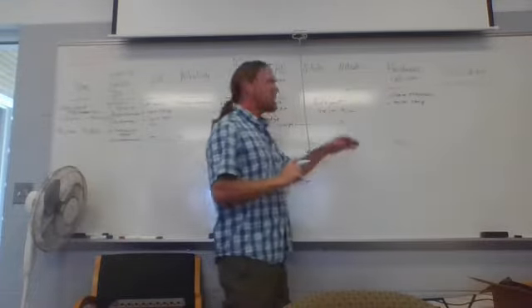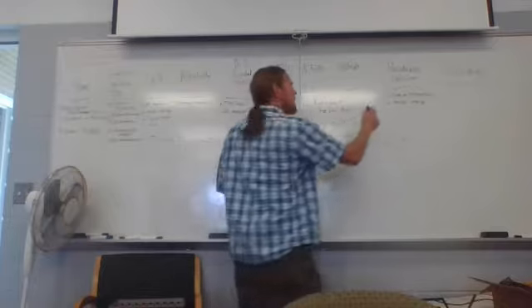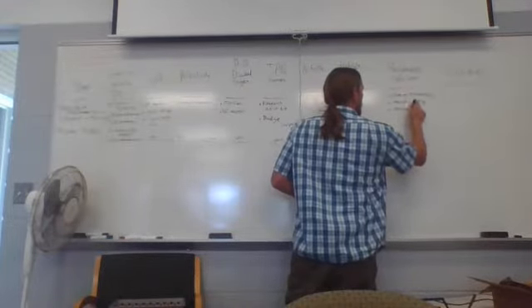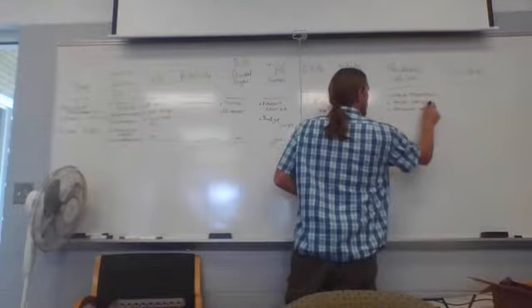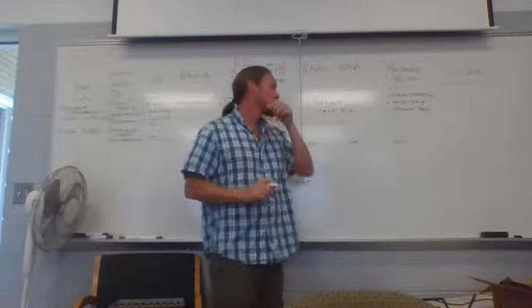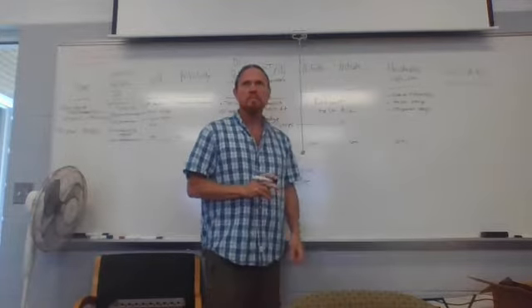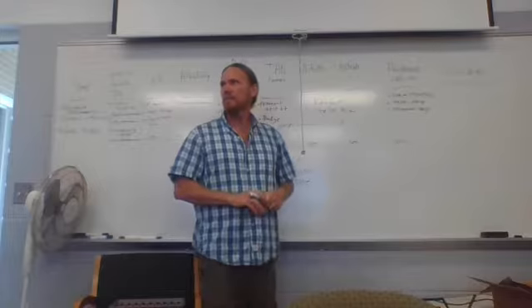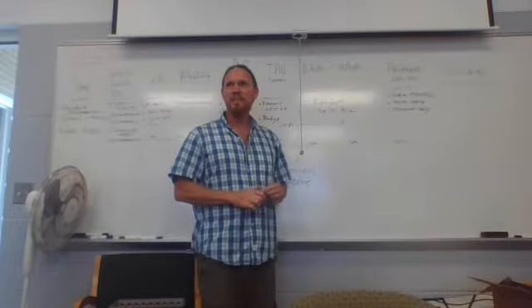And this one's a reagent test for calcium. And I have another one that is a titration for calcium. So they do make both those for hardness of calcium. I threw out another parameter I forgot was in, but just last week.